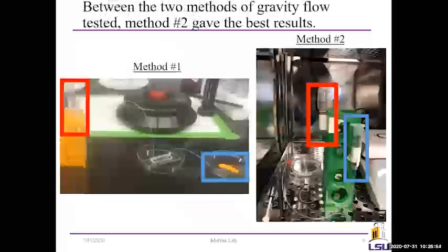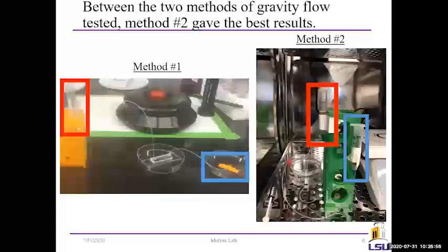After simulating mass transfer in our computational device, I designed a gravity-driven flow trial. In previous research done by other groups in this line of research, a syringe pump would have been used to disperse media in the device. Media refers to a fluid that contains cellular nutrients and the ability to carry away cellular waste. However, syringe pumps, which were something that I was trying to replace, are very expensive, often costing up to $5,000 per pump and take up a lot of space on a lab bench.